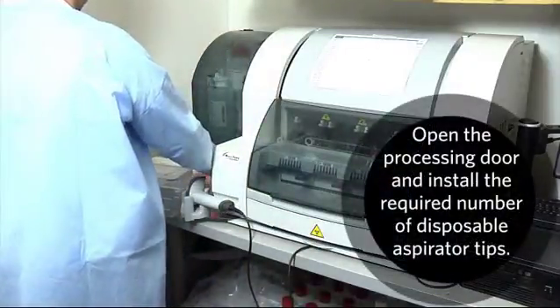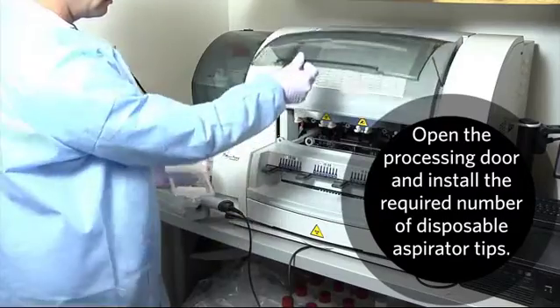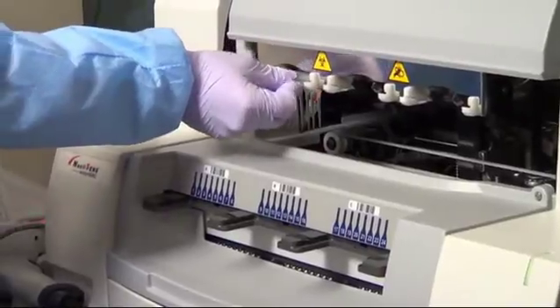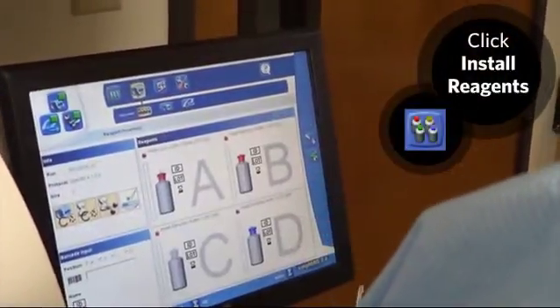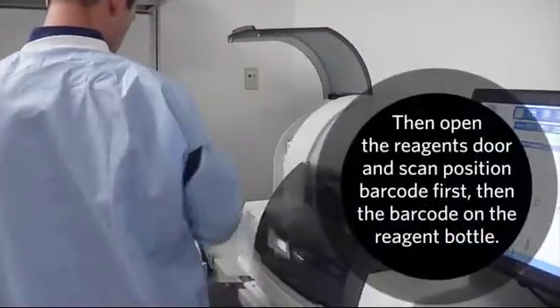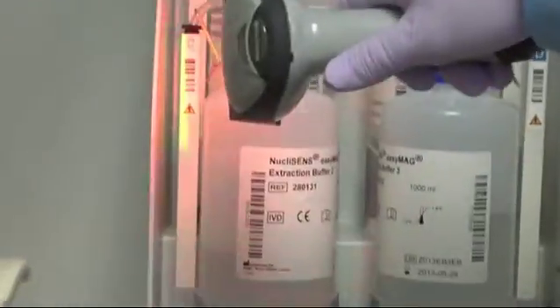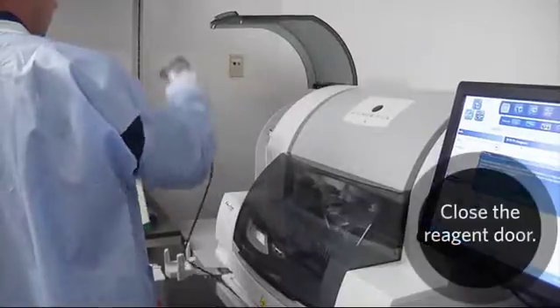Open the processing door and install the required number of disposable aspirator tips. Click Install Reagents. Then open the reagents door and scan the position barcode first, then the barcode on the reagent bottle. Close the reagent door.